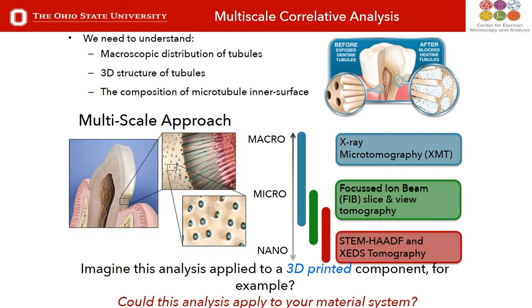And what we're going to do is use X-ray microtomography. On the right hand of our slide, we're going to use X-ray microtomography to see sort of a more macro scale. We're going to identify individual dentin tubules. These tubules are going to be around a micron in diameter. And then we're going to go in and remove those tubules so that we can put them into the TEM and actually do chemical analyses and see that the Sensodyne toothpaste is actively working.